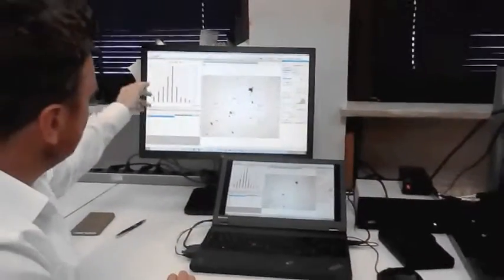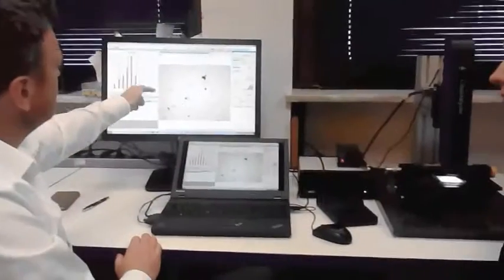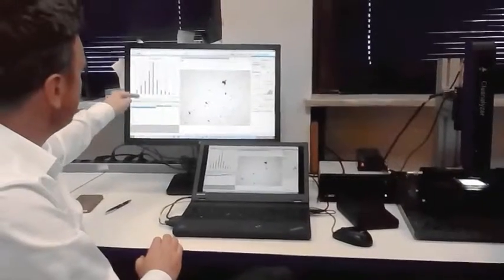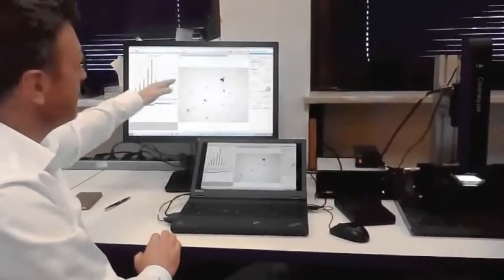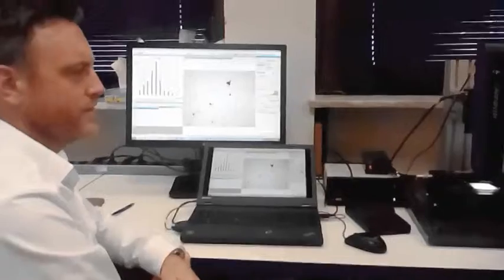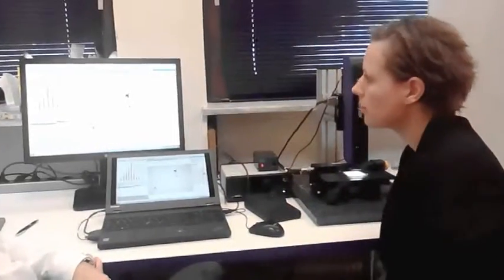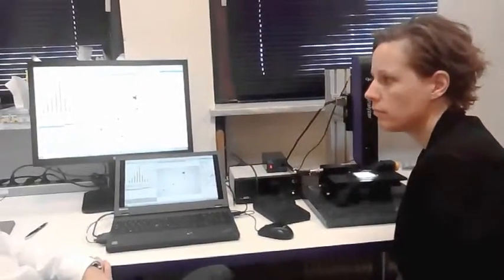So this would represent the thresholds of count that we are permitted of particles, and as we go through the test, this will populate here, and we will see if we are in specification or not. As soon as we get higher with our measured lines, we can interrupt the measurement if we would like.